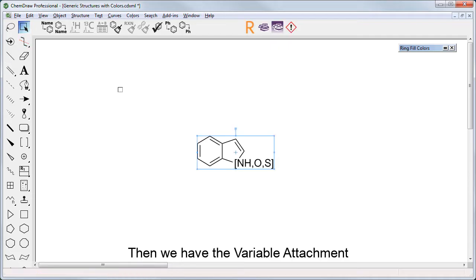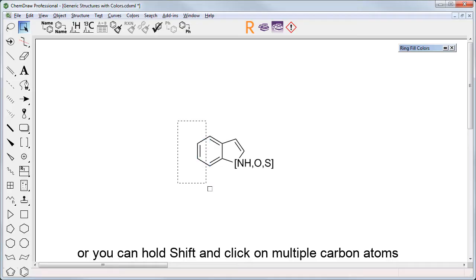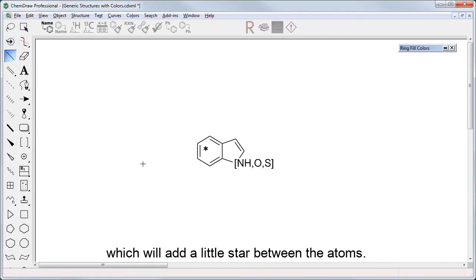Then we have the variable attachment. You select specific carbons with any selection tool, or you can hold Shift and click on multiple carbon atoms. You then go to Structure, Add Variable Attachment, which will add a little star between the atoms.